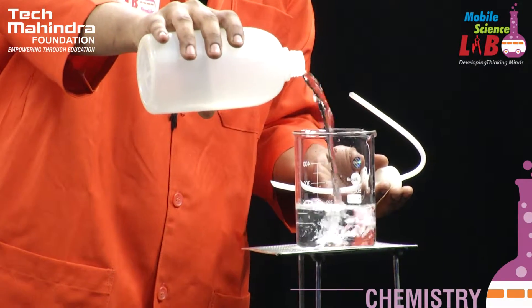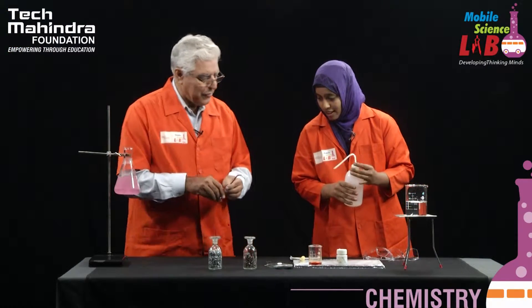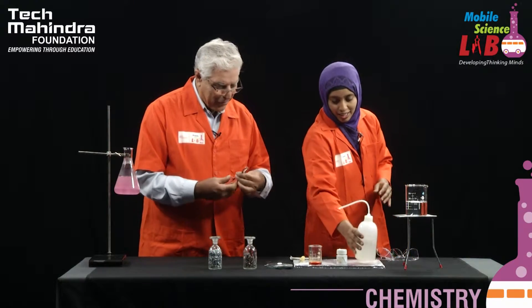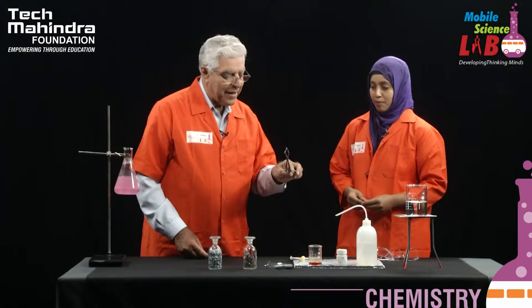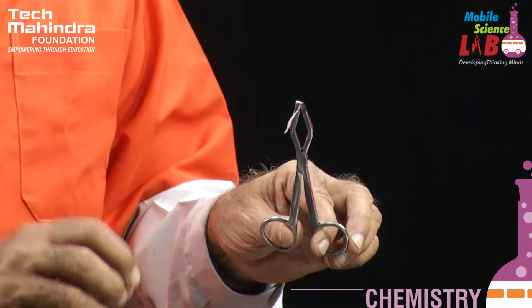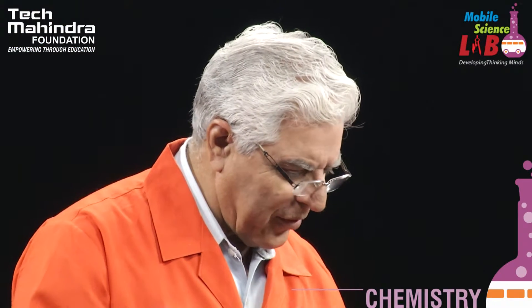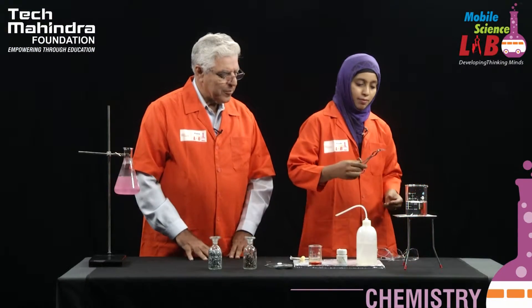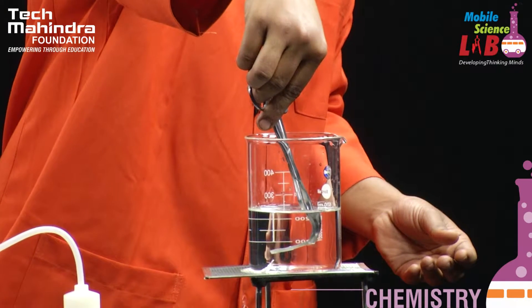These metals are going to react vigorously with the water — we will see that right now. I am going to give you a small piece of magnesium ribbon, held in this tong, and I am asking you to just place it in water — don't drop it, just dip it and see what happens. It's not reacting, sir. There is no reaction at all — that is right.